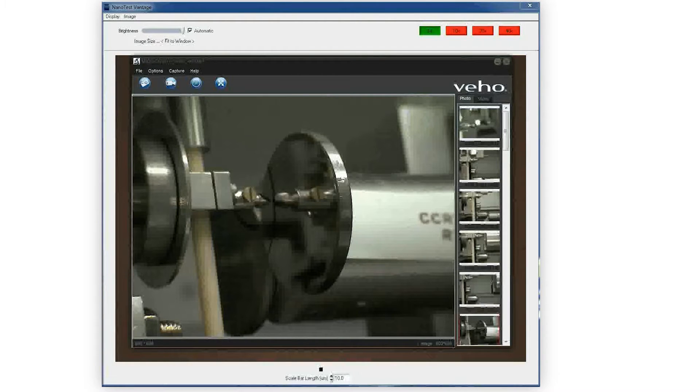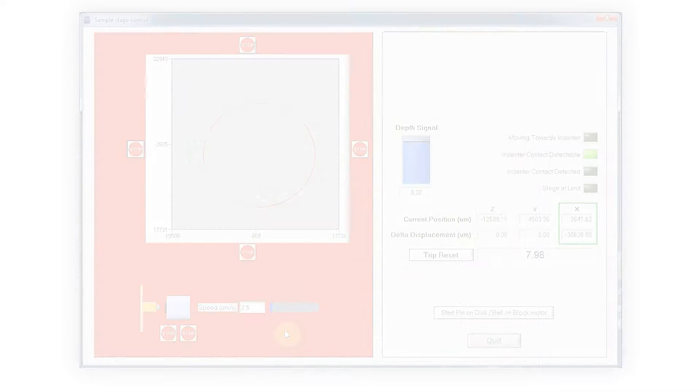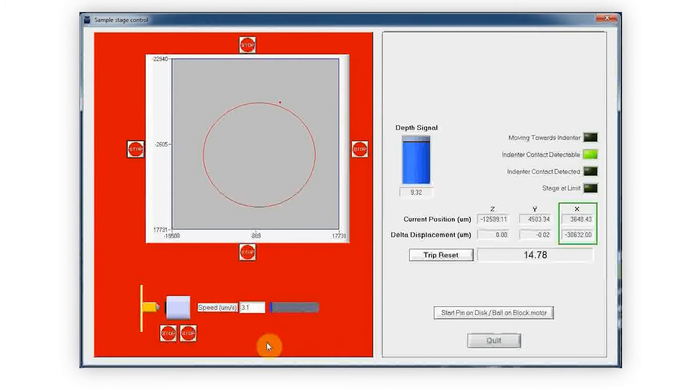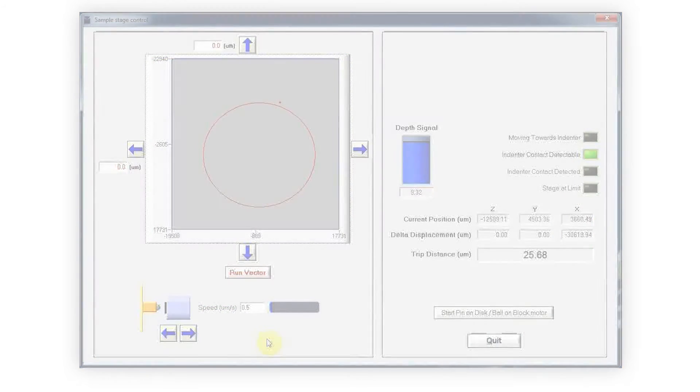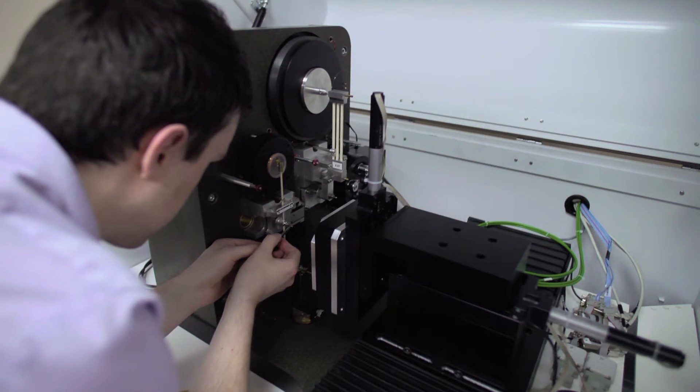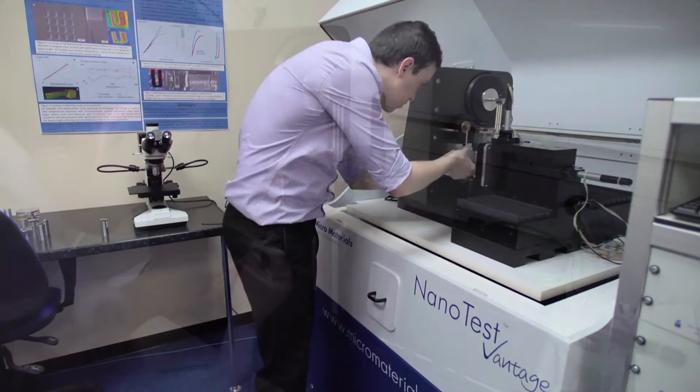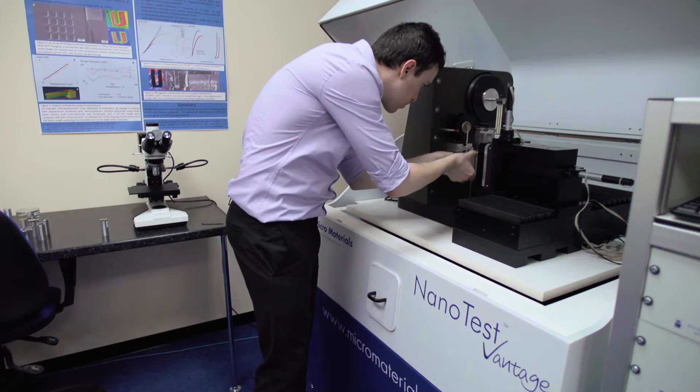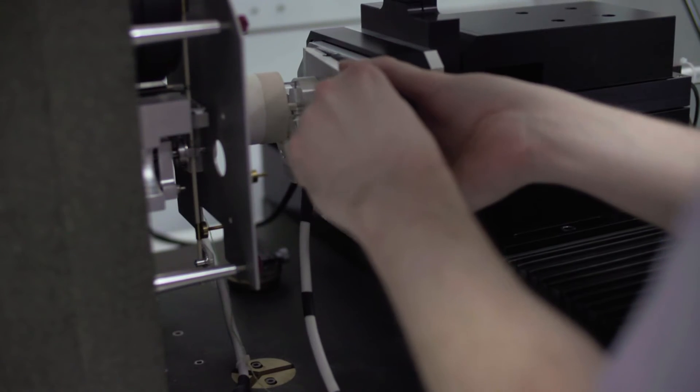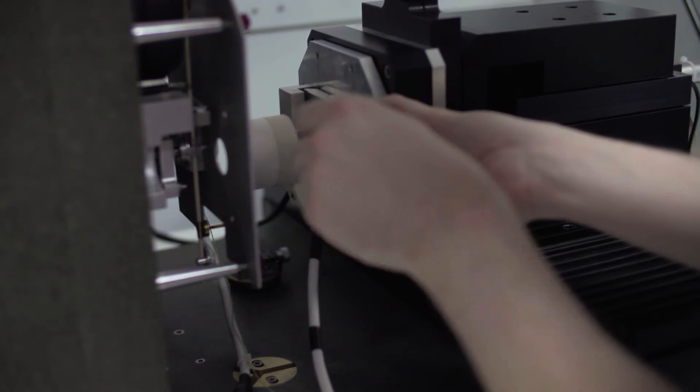The NanoTest Vantage includes, as standard, a four-objective optical microscope and a 3D nano-positioner for the imaging and positioning of experiments with nanometer resolution. In one instrument platform, it is possible to combine multiple nanomechanical test techniques over multiple force scales and multiple environments to provide the most complete solution on the market.